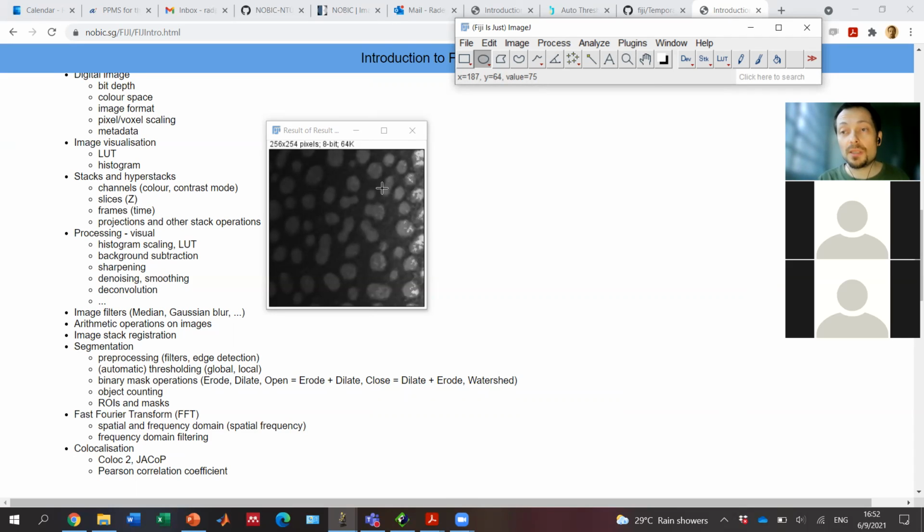I can do something even more sophisticated. I can use machine learning approaches, which allow me not just to use the intensity information, but they can also use criteria like the shapes of the objects, which can all be taken into account when doing the segmentation.